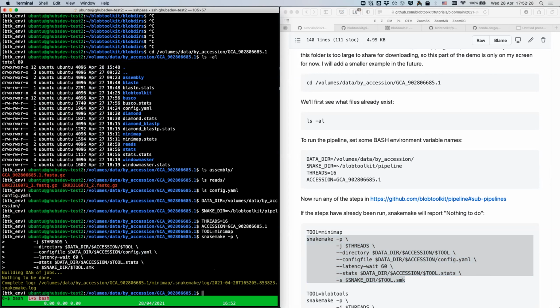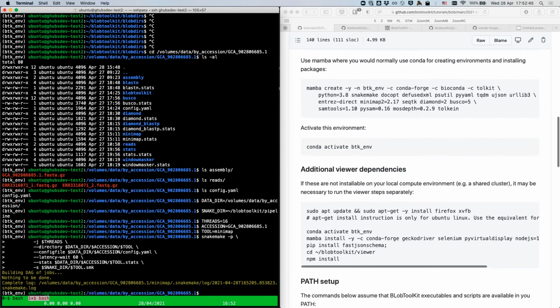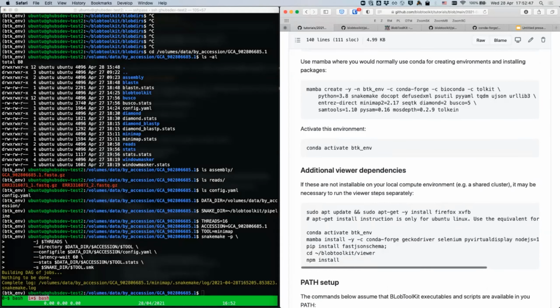But when you did that first command, that was a Snakemake thing that had all of these steps in it together, right? That was just to set up the environment. Sorry, my bad. I just wanted to check. I was following. That was this command. Maybe you're confused because that said Snakemake and this says Mamba. So the images that we've already created, how is this different? Where have we created images? I didn't think we had created any.